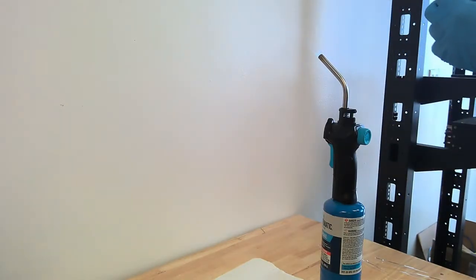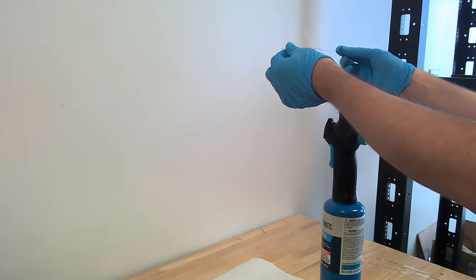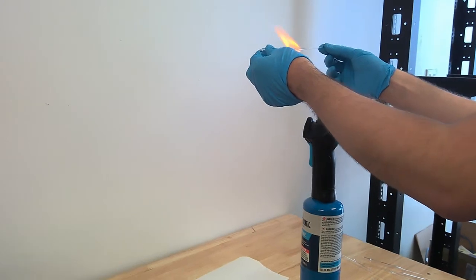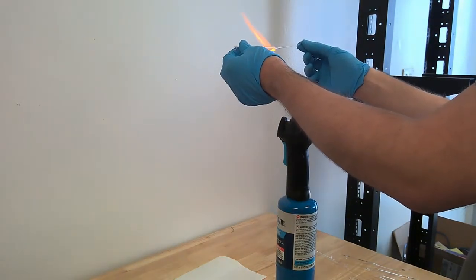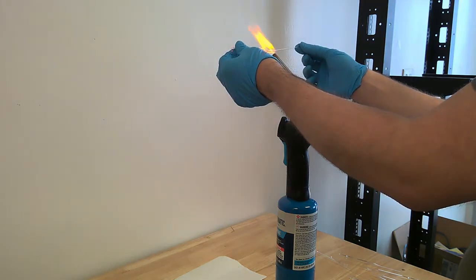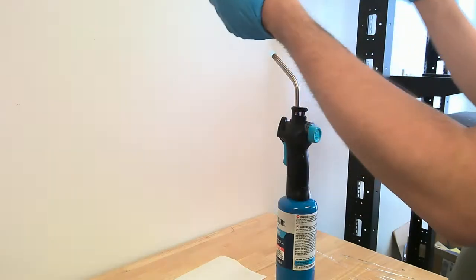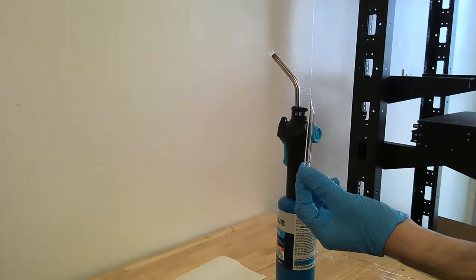Okay, so now we're going to begin and we're going to pull the first components of our micropicnometer and the components needed for our capillary bell. We're going to heat our pipette just in front of the point where the glassware begins to taper, and we're going to carefully swirl and move both ends of our pipette, keeping it immersed in the hottest part of the flame. As the glassware becomes more and more malleable, it'll eventually reach a point where you can pull and bend and extend the glassware, and we're going to pull our pipette as we take it out of the flame.